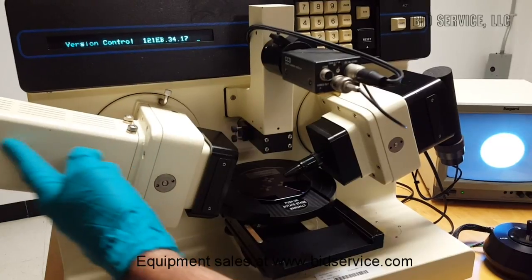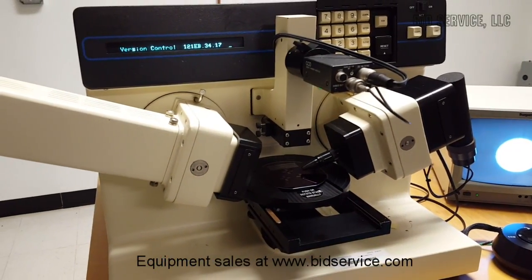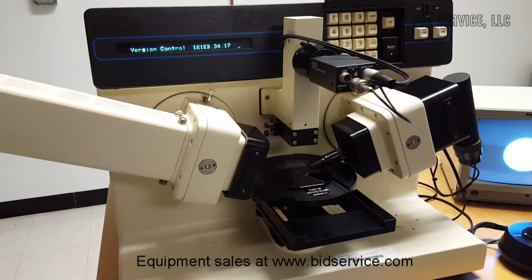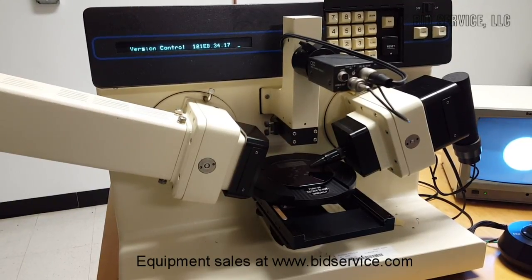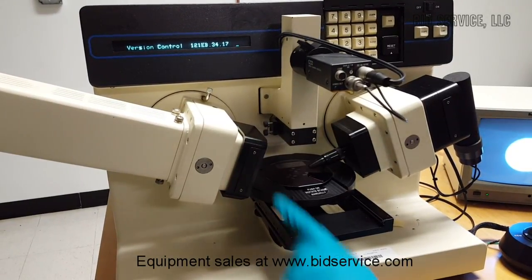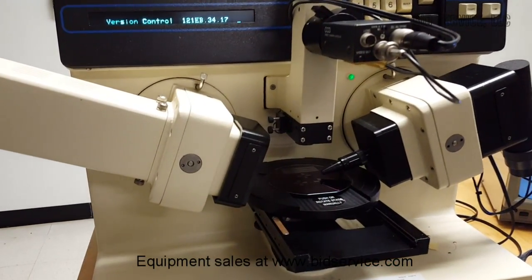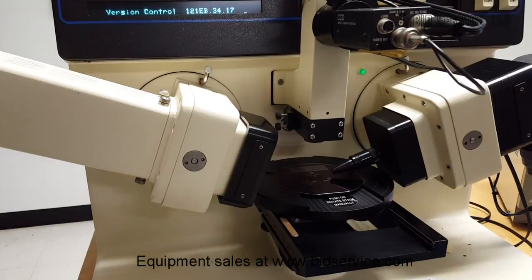The system source is a halogen lamp, 12-volt lamp. And there are filters inside the polarizer side for various wavelengths.